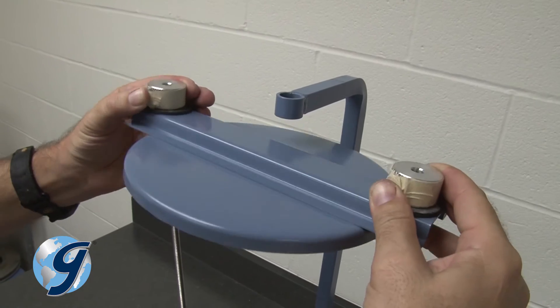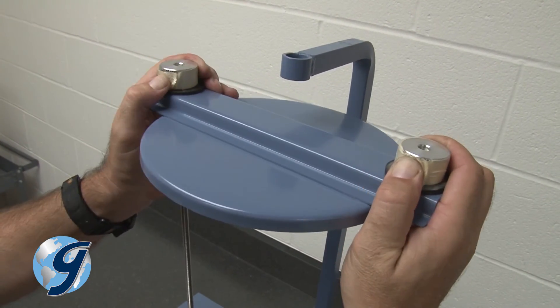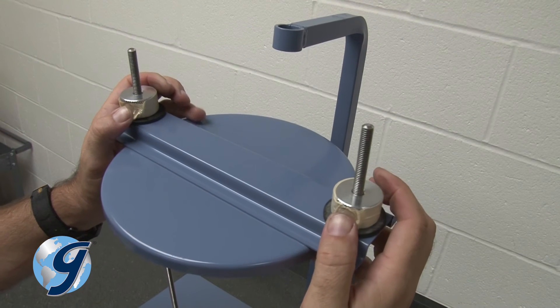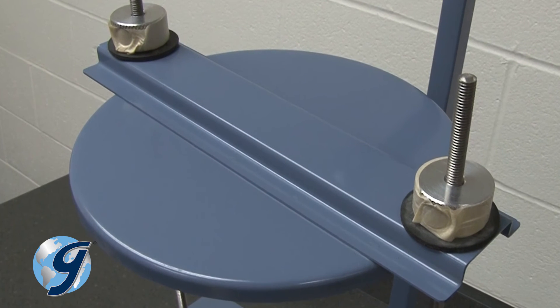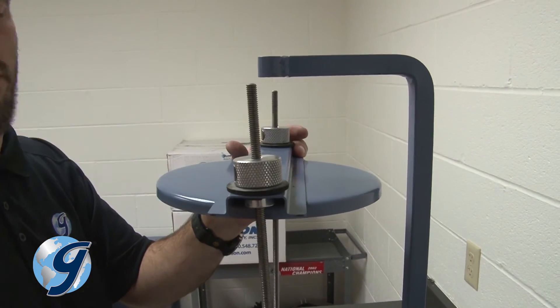Now place the sieve cover clamping assembly onto the sieve retaining rods by pressing both buttons of the Easy Clamp knobs and slide the sieve cover down. Release the Easy Clamp buttons and sieve cover so the sieve cover clamping assembly will remain stationary on the sieve retaining rods. Remove the tape from the Easy Clamp assemblies.